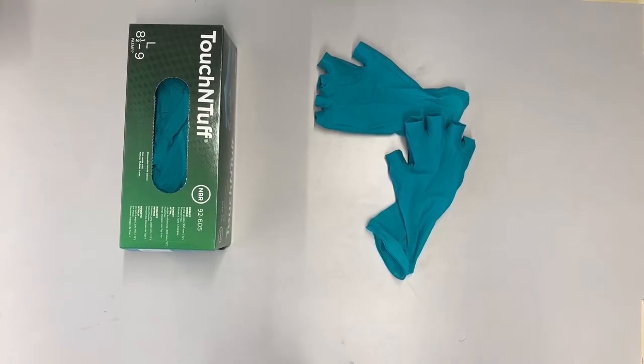Then throw them away in the solid waste bin. If you start working with chemicals, put the gloves on. When you're done, take them off. If you want to do anything in between, take off your gloves.